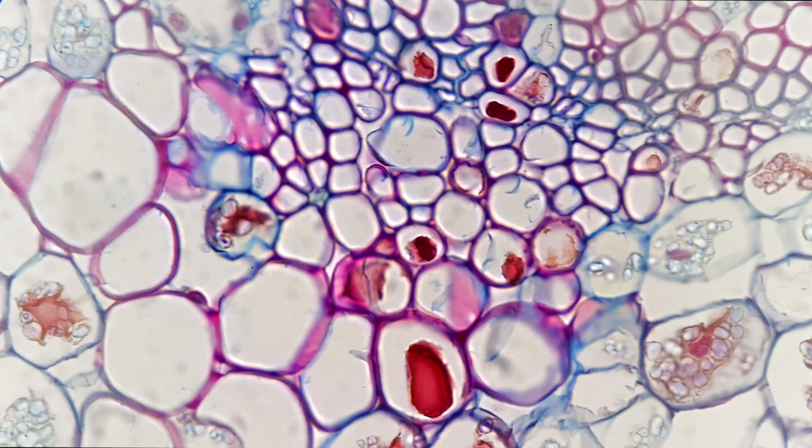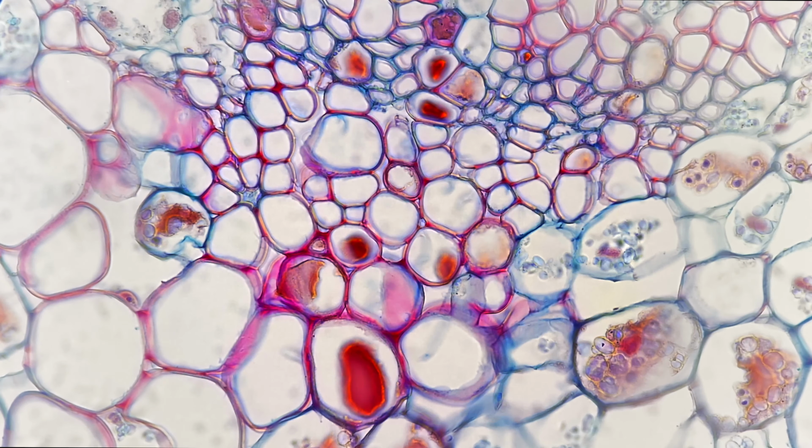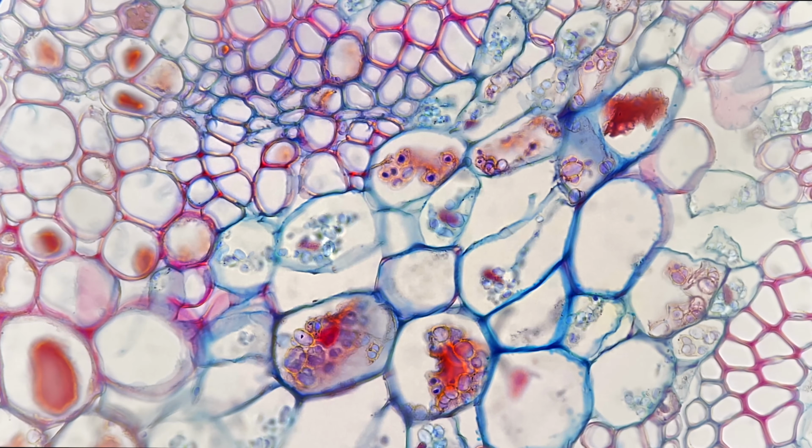With 400 times magnification, you can see a lot more detail and structures of what's going on inside the phloem cells.